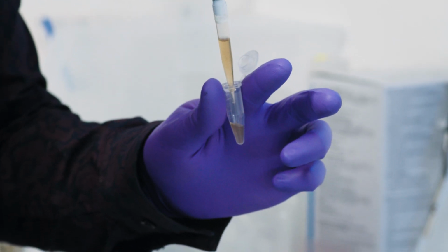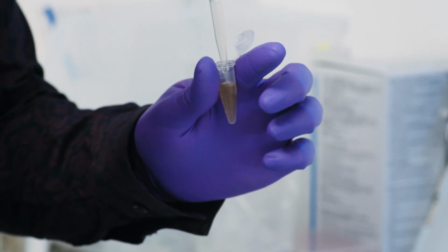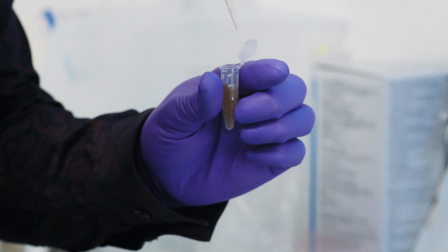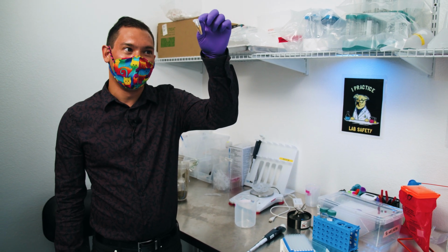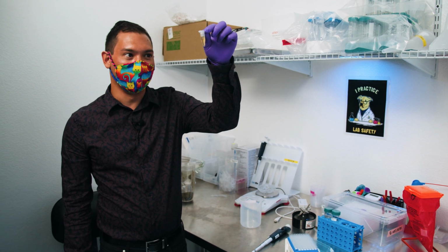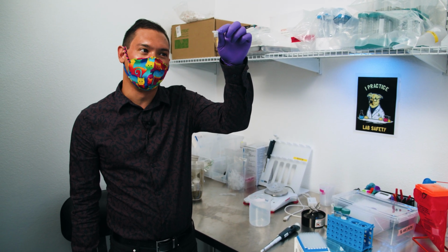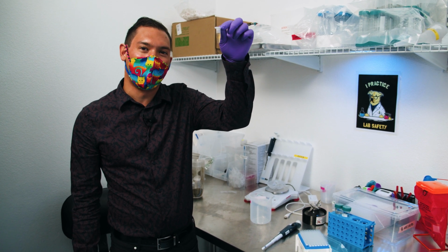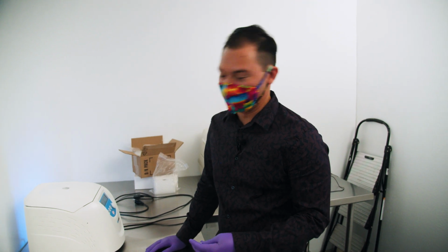As many cannabis scientists know, cannabis is a notoriously difficult matrix to analyze. The reason for this is you have upwards of 30% expression of cannabinoids, terpenes, and other compounds. So a key point here is we want to clean up our sample to make sure that we can get exactly what we need from it without having all the background noise. As I said, in cannabis analysis, one of the most important things to do is make sure that our matrix is under control and we're able to get what we need out of our sample.